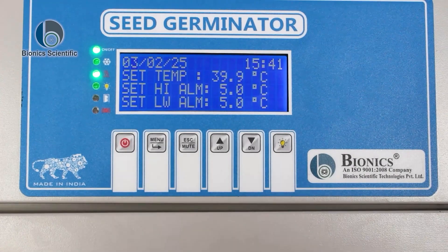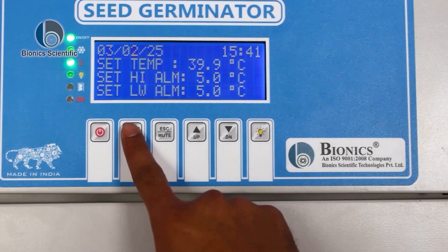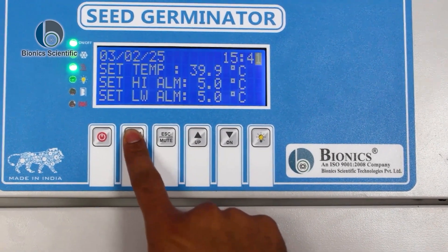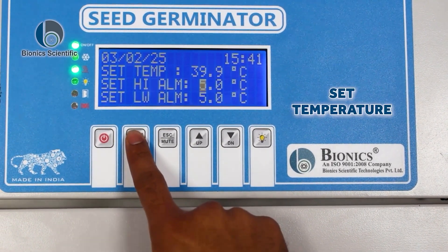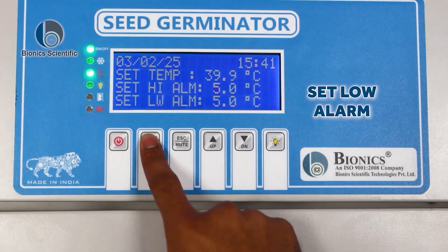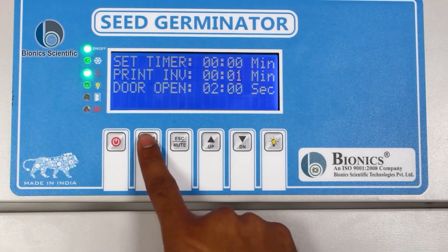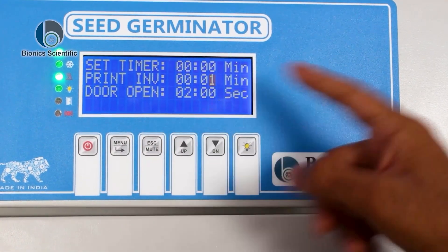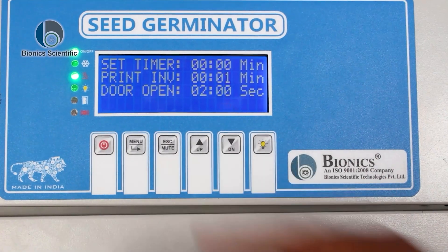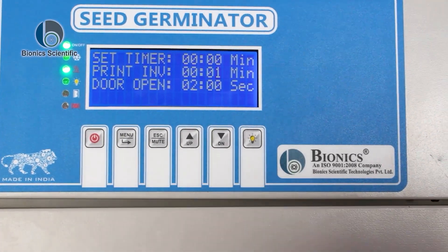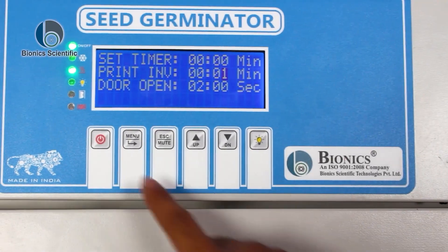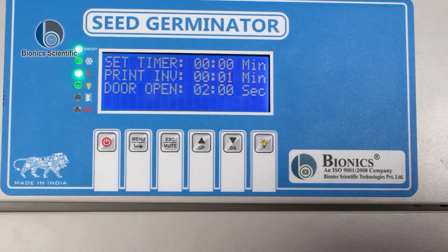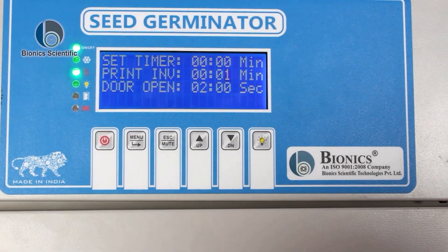If you want to go to the next setting, press the menu button again, and keep pressing menu to cycle through the options: set temperature, set high alarm, set low alarm, set timer. A printer provision is also there. A door open provision is also there — for example, if the door gets opened for two seconds, a beep alarm will sound. That helps us know when to close or open this gate and for how long.